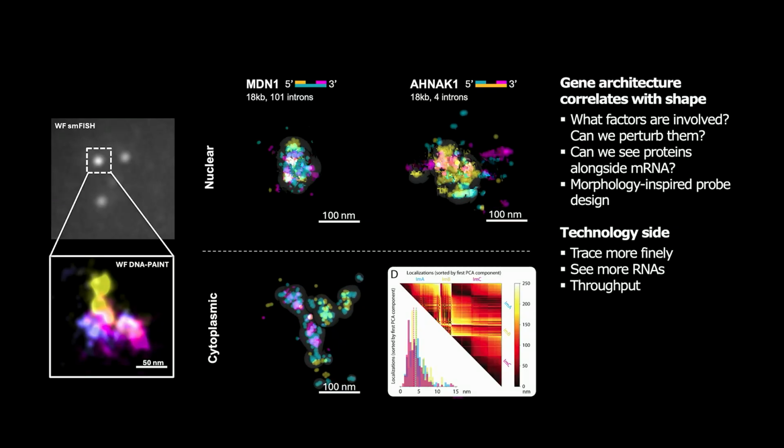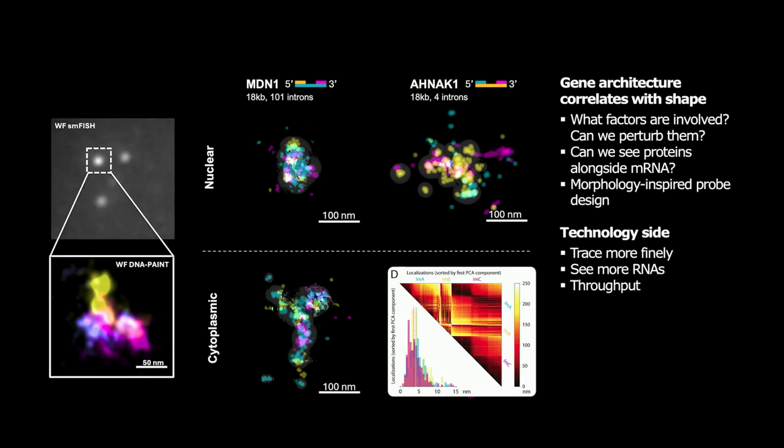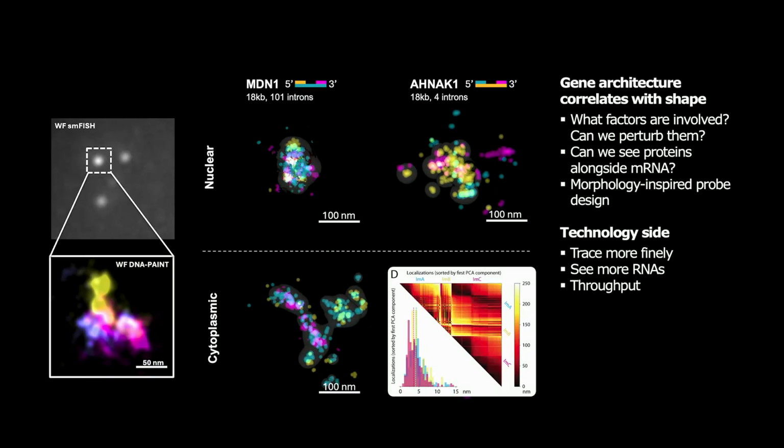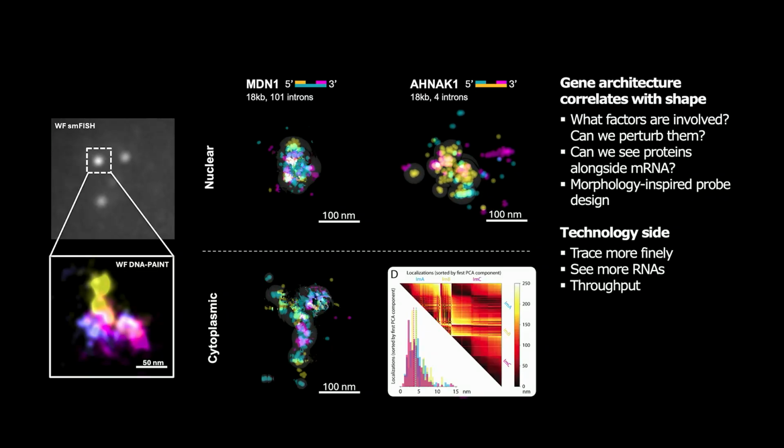But stepping out, I want you to reflect on where we are coming from. Standard or regular smFISH looks like this from the 80s, from Robert Singer and others. But of course, nowadays with the best probes, the best cameras, the best protocols that we have, the best probe design, the probe design is key here for all this that is shown. But we can already, without MINFLUX, have a new set of eyes on this object, and even with MINFLUX, take it to the level of looking at what these flexible objects are actually doing in several scenarios.